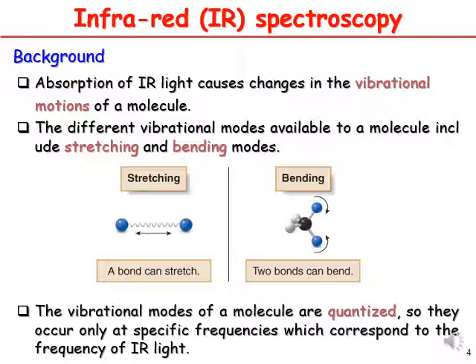In this case, we can refer to either the wavelength or wave number, and so the motion can be determined. Whether stretching or bending, we can identify it based on the range of the wavelength or wave number. From this wavelength or wave number, it has a relationship to the frequency, and after that you can explain more about the frequency.